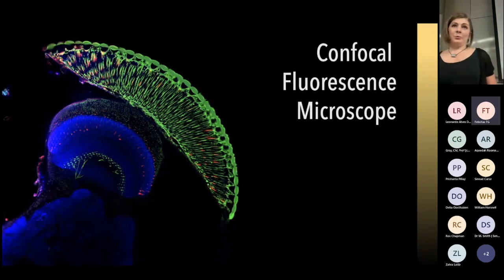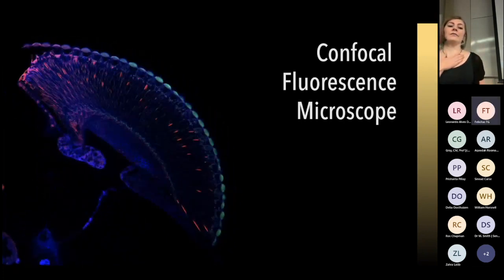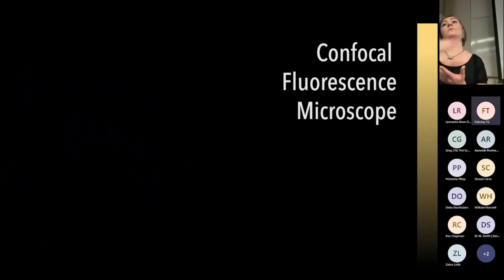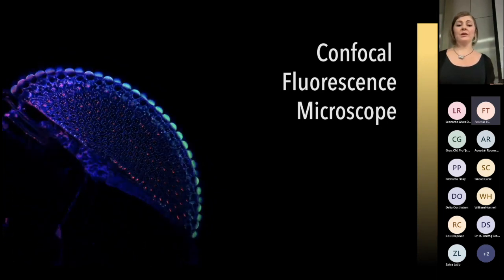And if you want thicker samples, of course, your next step would be to confocal microscopy. And this is an image of serial sections through a fly, the eye of a fly, optical sections, not physical sections. So you can really go very deep into a structure or a tissue. And you don't have to have large samples.